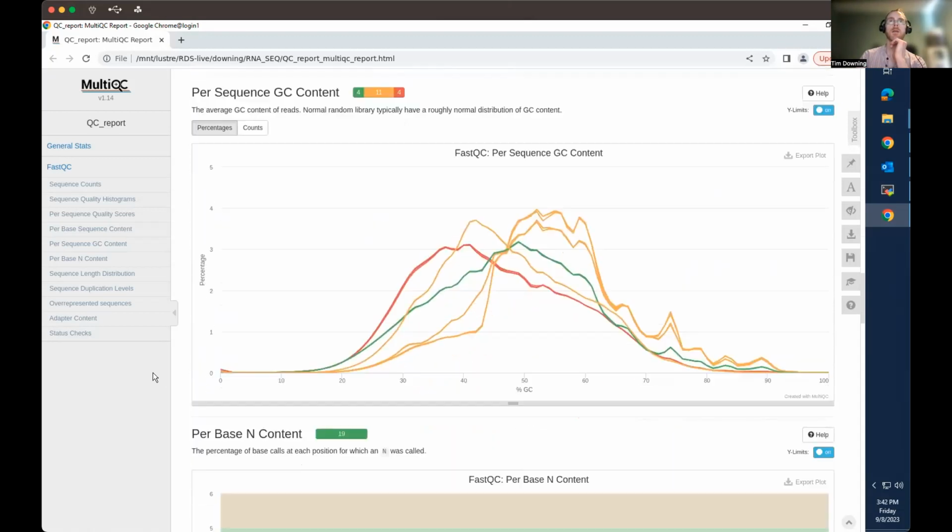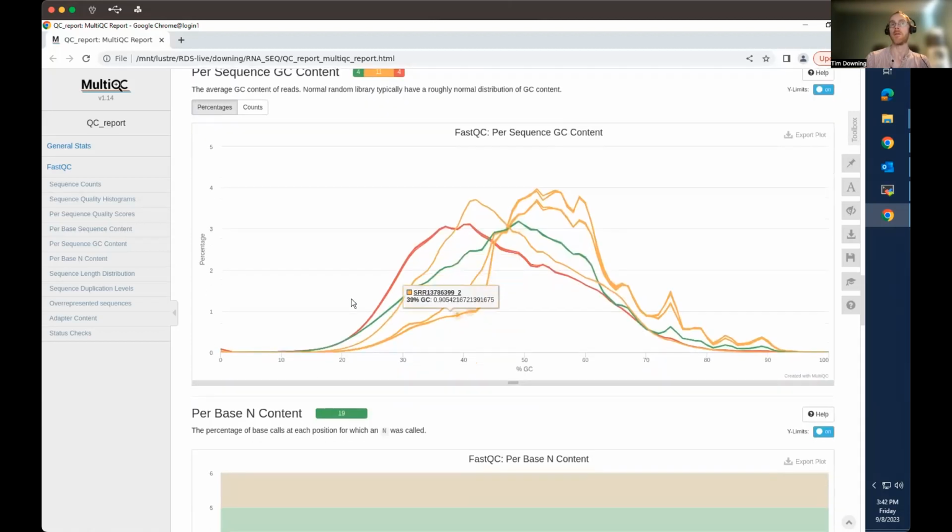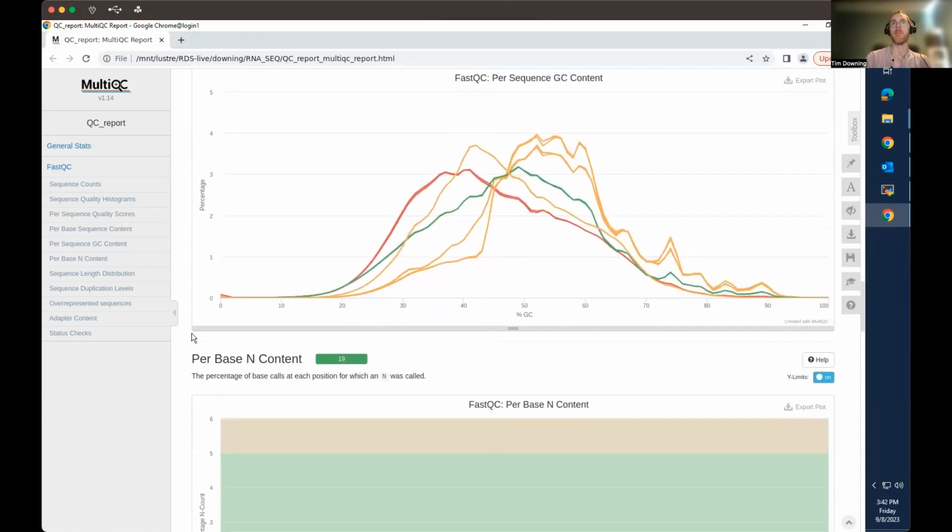The GC content is a bit of a puzzle in that there's such a wide variation, but there are differences in expression here. And we have to remember that we're sampling different transcripts at a point in time. So that would suggest that we likely need a lot of different samples from these animals to really understand their variation in the immune response.